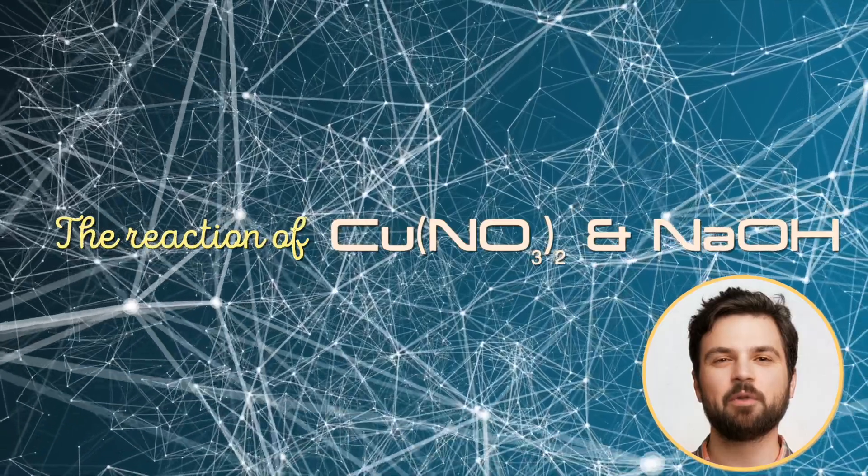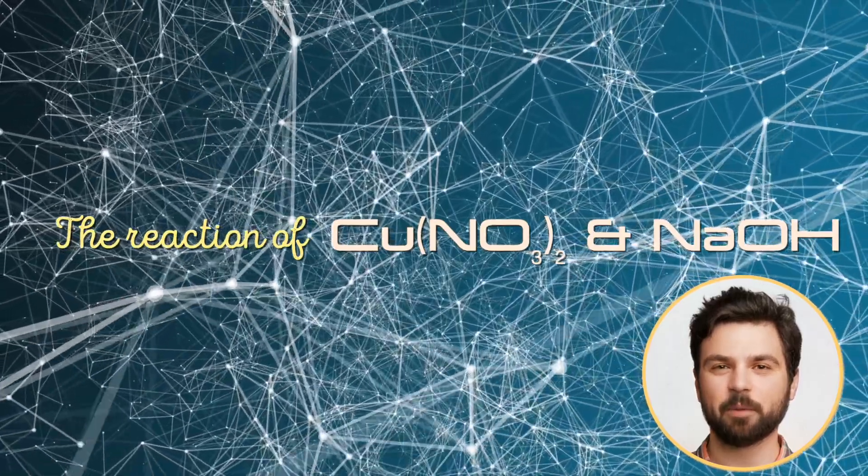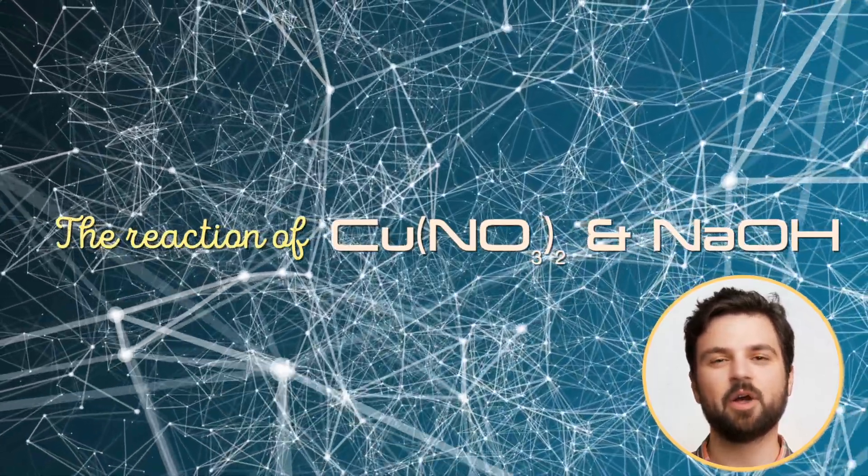Today, we are going to observe a chemical reaction between copper nitrate and sodium hydroxide.